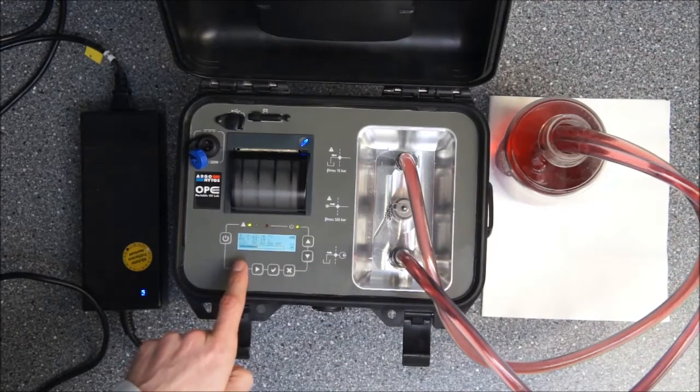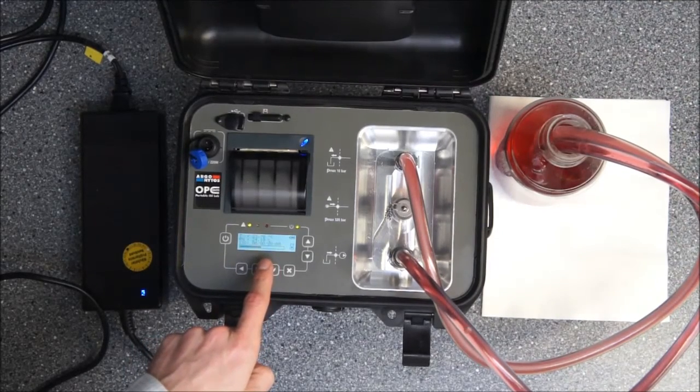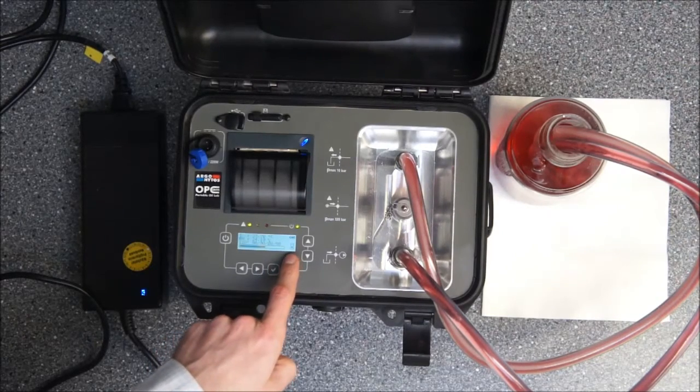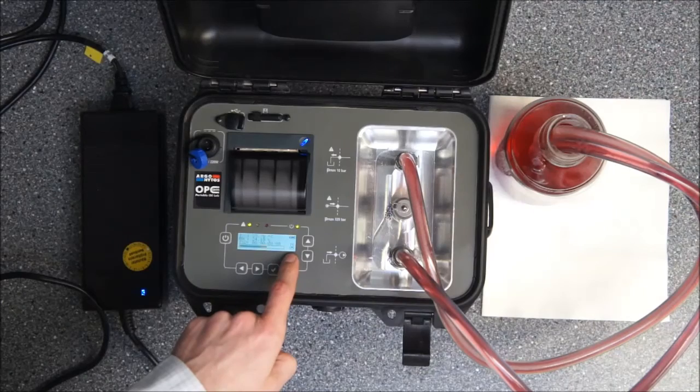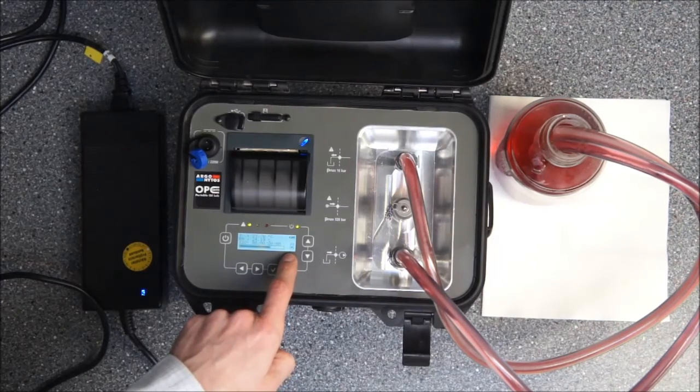There is a progress bar on the bottom that is just indicating how long the measurement still takes and how far the progress is. On the right side you see a small pictogram for the pump, so that's the pump mode we are currently in, and also you see the M for manual mode on top of it.